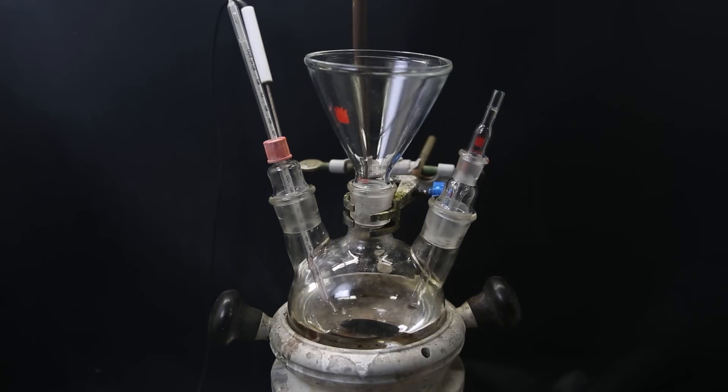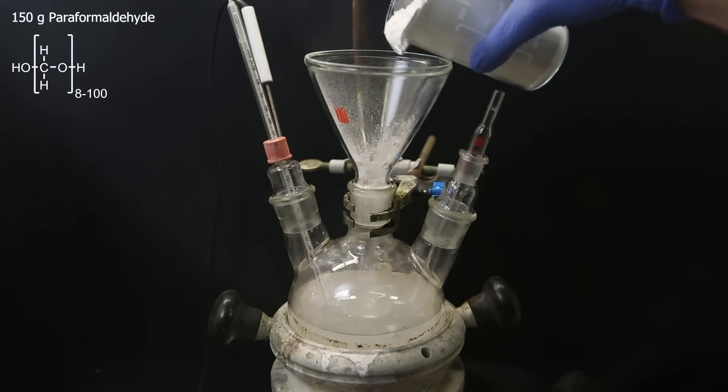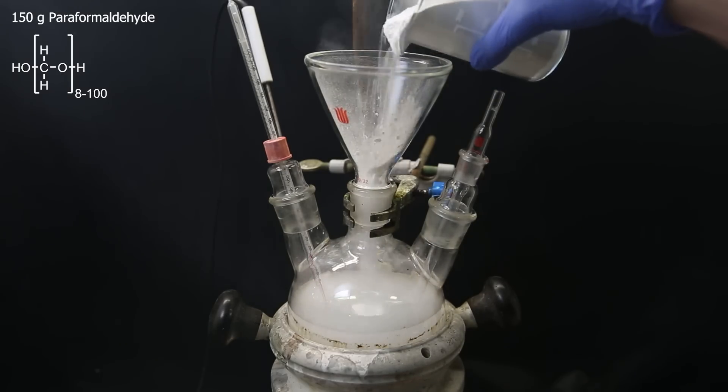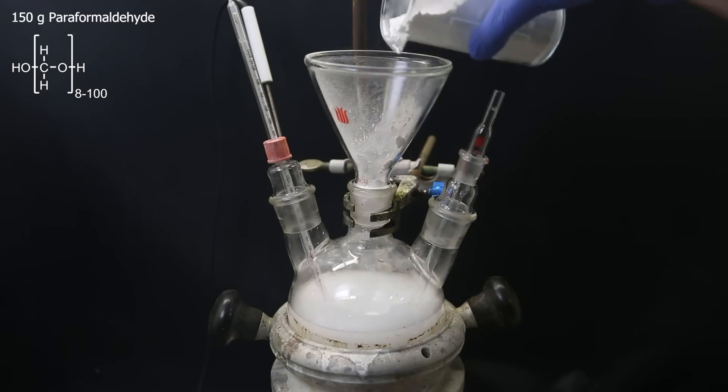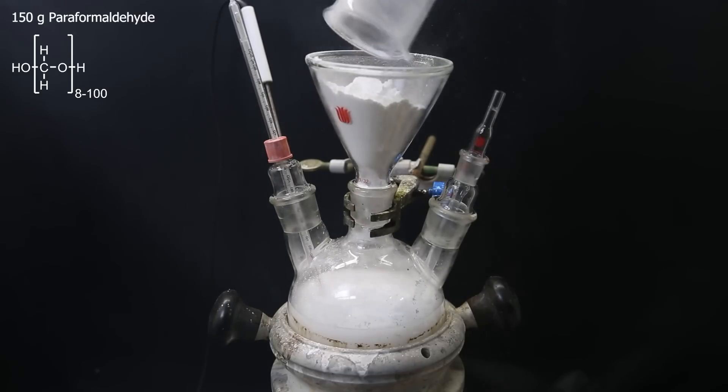I then attach a funnel, and while stirring, I add 150g of paraformaldehyde, which can just be bought online, and is also very cheap. It should be done in a very well-ventilated area, because the dust is irritating. It's very fluffy, and decided to all fall out at once.